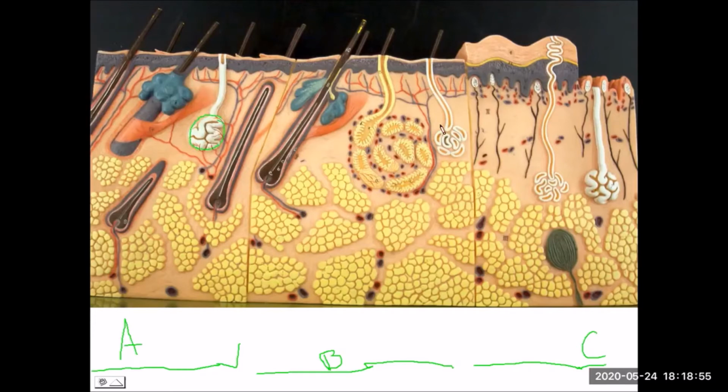So we'll start with the sweat glands, the ones here shown in white. You notice these are spread throughout all three of these different skin samples. This is a very common eccrine sweat gland, also known as merocrine sweat gland. Here in the axillary region, that is one location of the very large apocrine sweat gland.